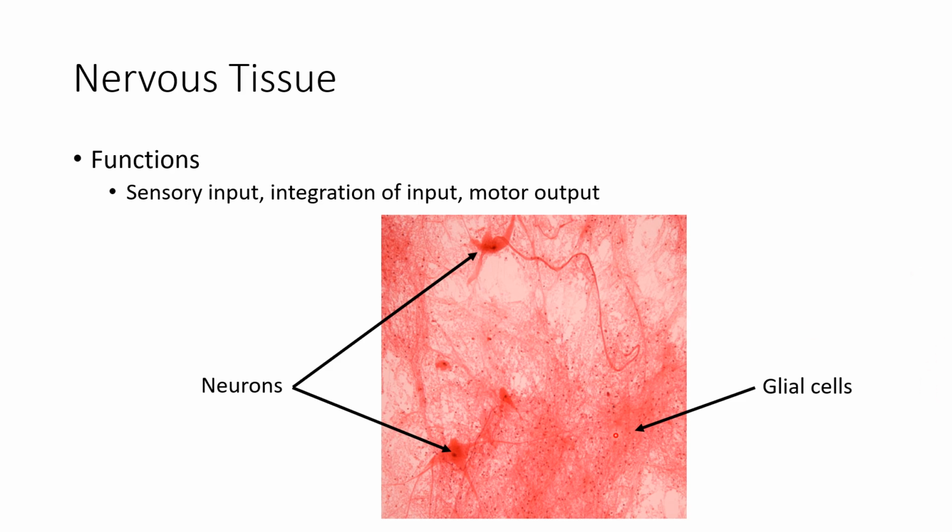It's almost like really dense cobwebs, and all of these little dots that you see with the spindles coming off of them, those are called glial cells. They're basically the helpers of the stars of the show, who are our neurons. So the neurons, there's one here and here and here and here. They kind of look like simple squamous epithelium, but with tendrils coming off of them.